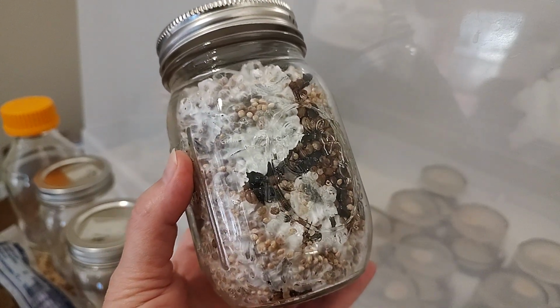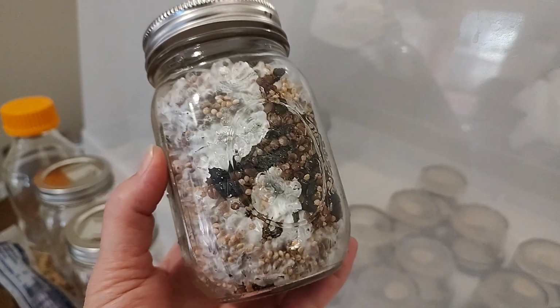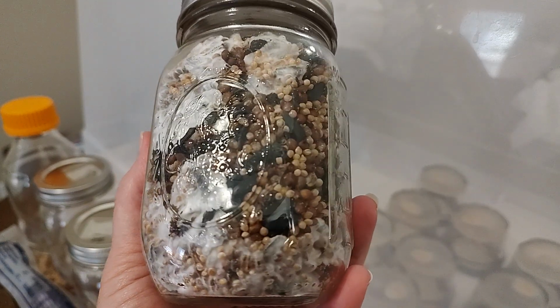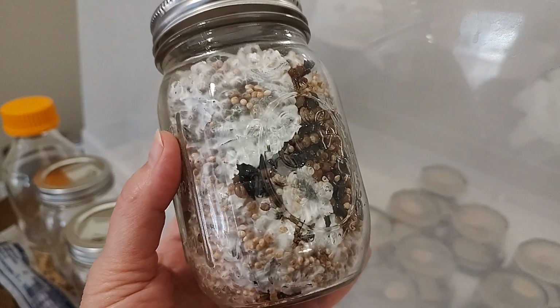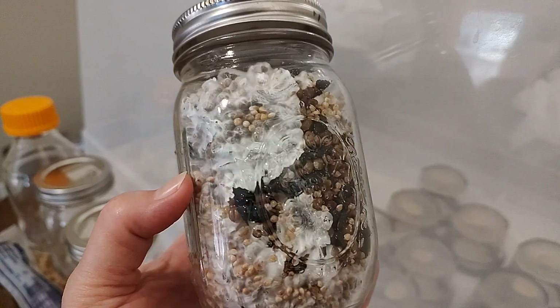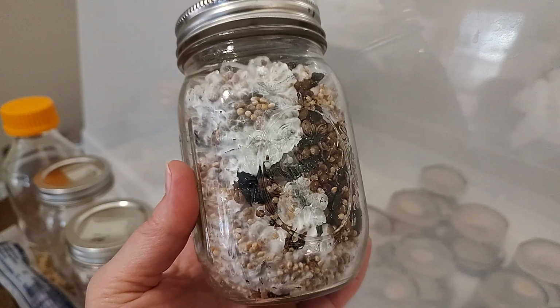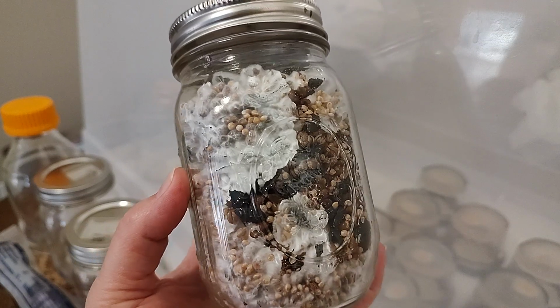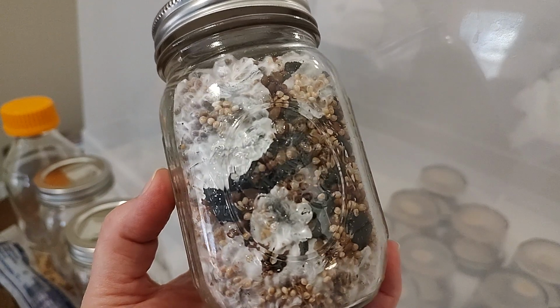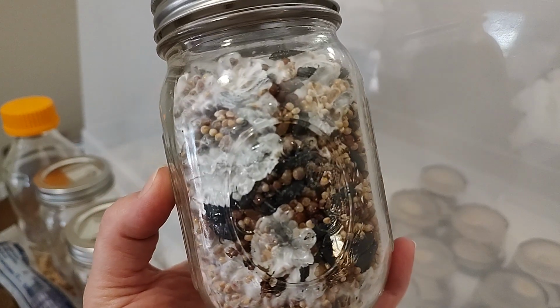It is just a better way to use your time, money, and time and money is energy. And so it really is a better use of your energy, whether it's time and money, by skipping this process with the spores and going straight to creating mycelium. And we're always looking for this rhizomorphic mycelium that looks like antlers or branches. And it's always on the leading edge of where it's growing. And you can see it here.